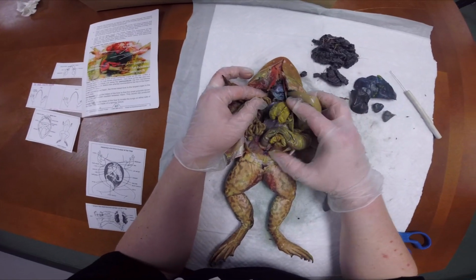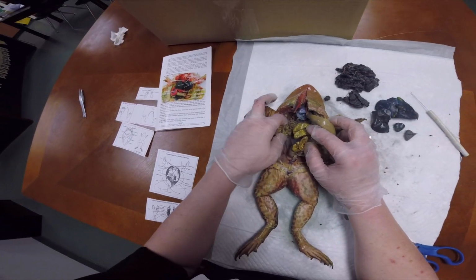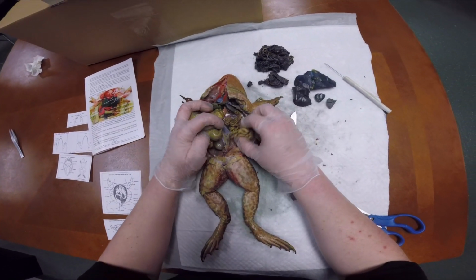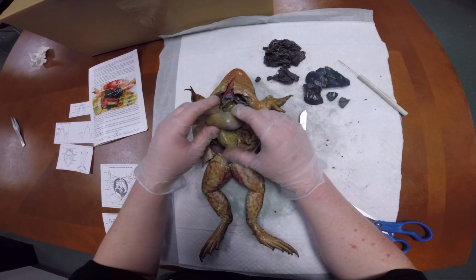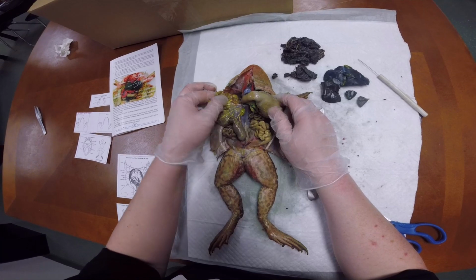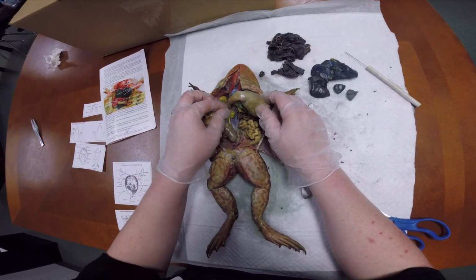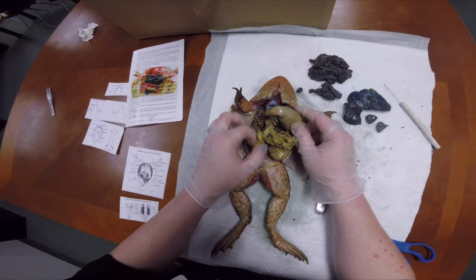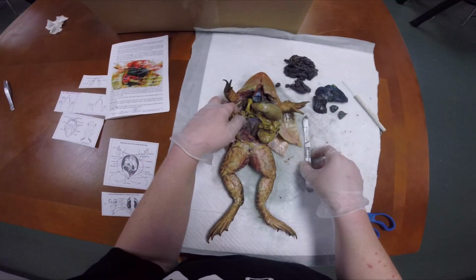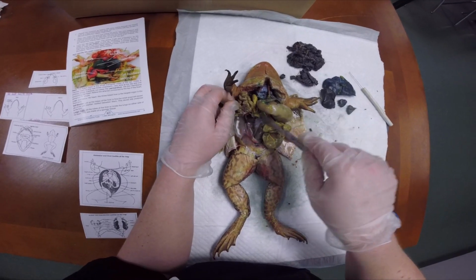This is the small intestine. Wow, I'm trying to figure out what this part is right here. I think that's the large intestine. There's a bunch of parts in this one, and it's kind of throwing me off. But let's cut out the small intestine.